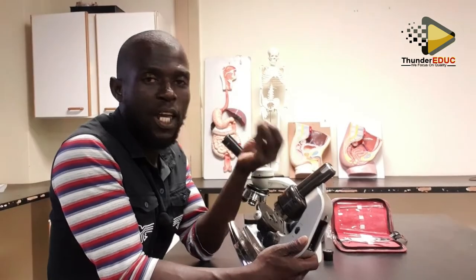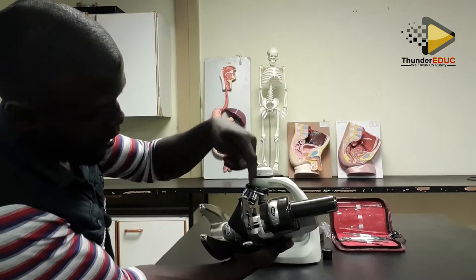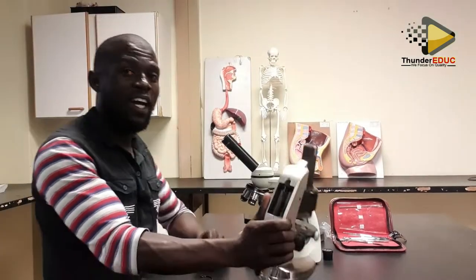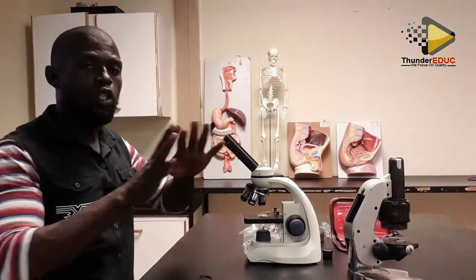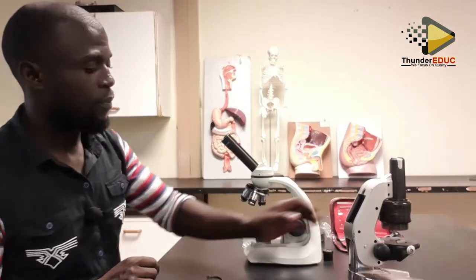But the problem here is that it doesn't control how much light is entering. Inside here, there is a bulb. That bulb will provide light, but not a specific amount. It will only give a constant amount of light. That's what you call a light microscope. We call it a light microscope because it uses light. Without light, we cannot see anything.